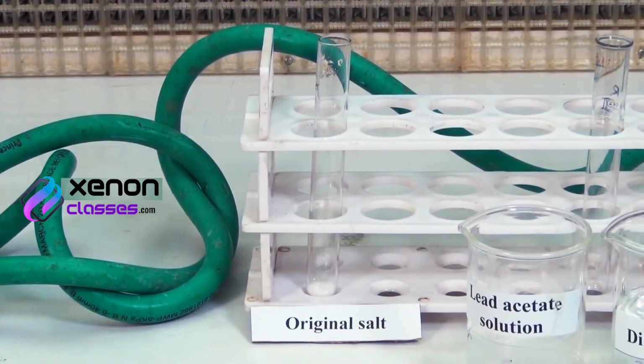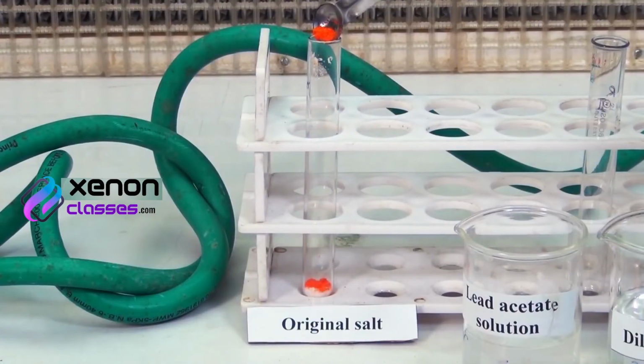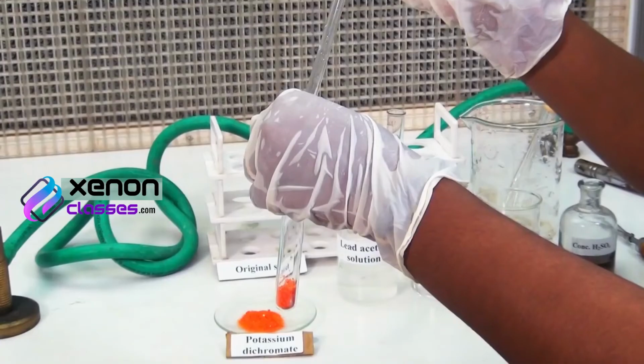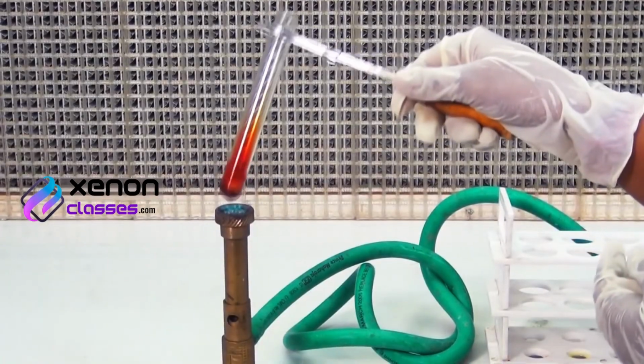Procedure: take a small quantity of the salt in the test tube. To this, add small amount of powdered potassium dichromate using the spatula. Mix the contents of the test tube with the glass rod. Now, add small volume of concentrated sulfuric acid into the mixture using a dropper. Heat the mixture over the Bunsen burner.